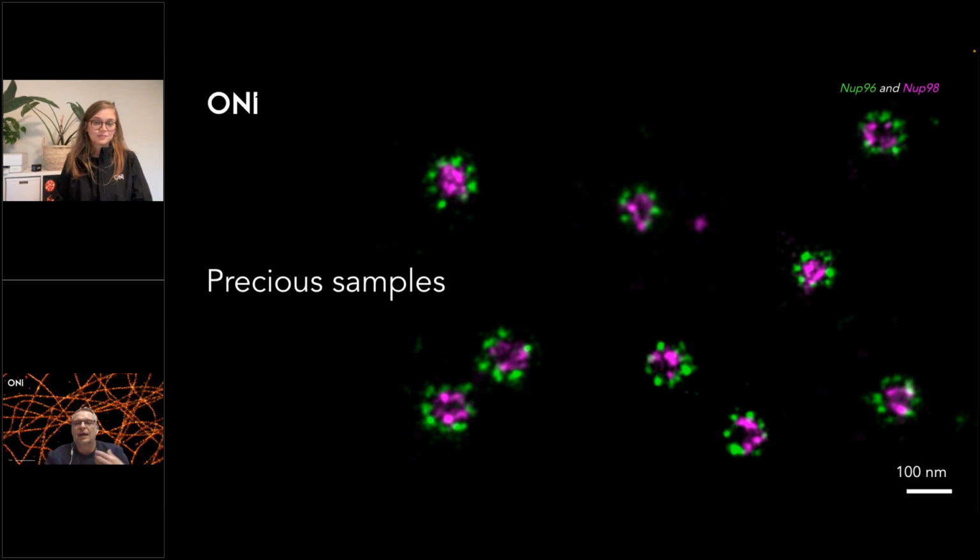We have dishes and flow chambers which can accommodate 5 microliters of volume. In this case, the probability that your cells will adhere within the time frame you usually use is very high. So I recommend taking dishes which can accommodate smaller volumes. And most importantly, optimize your protocol on some cell lines beforehand.